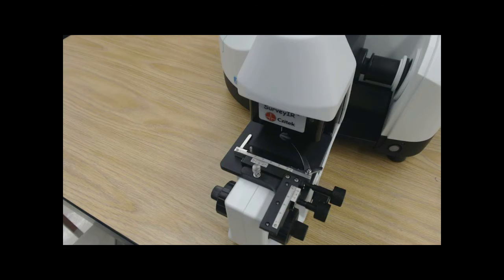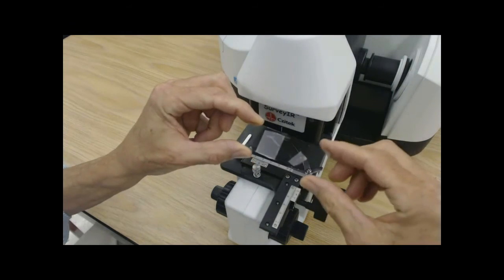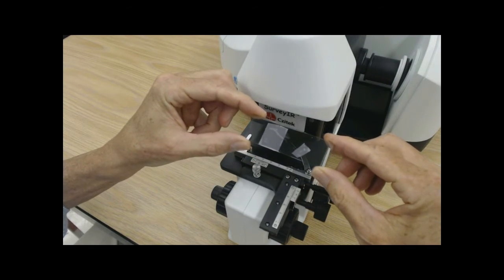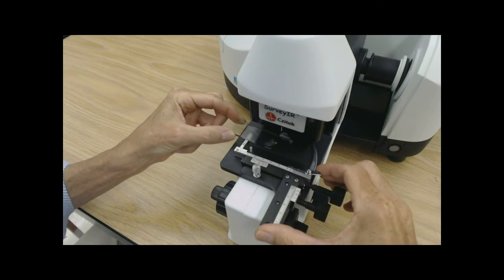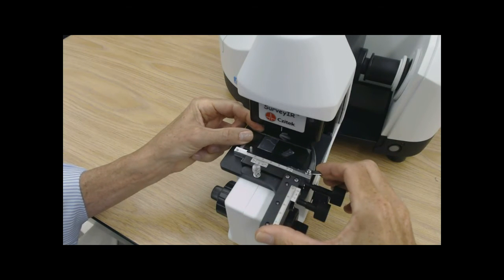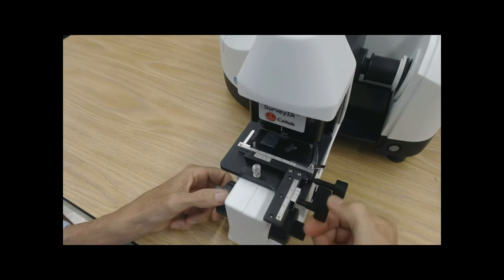Greg will now demonstrate the installation of 1 by 3 inch microscope slide substrates into the 1 by 3 inch stage clip. In this case, we're demonstrating a low e-glass substrate.